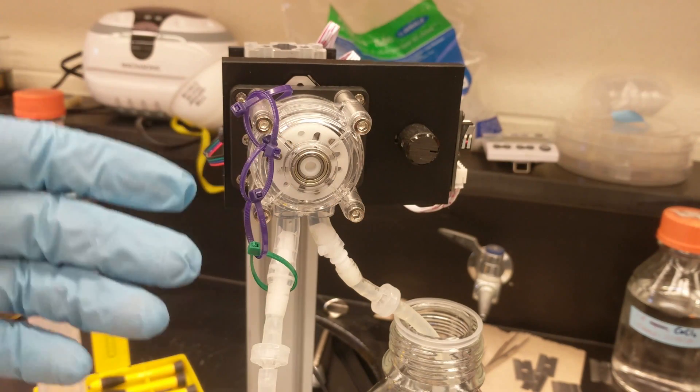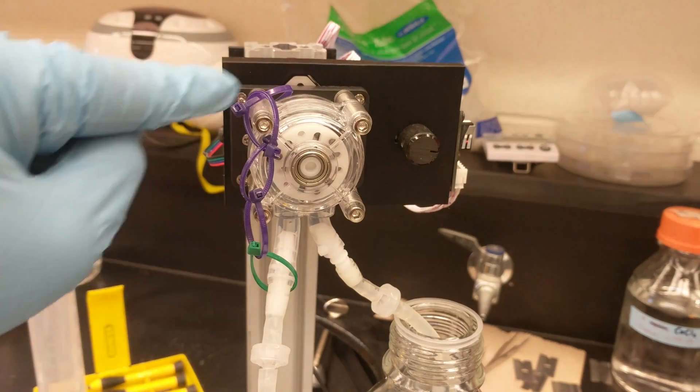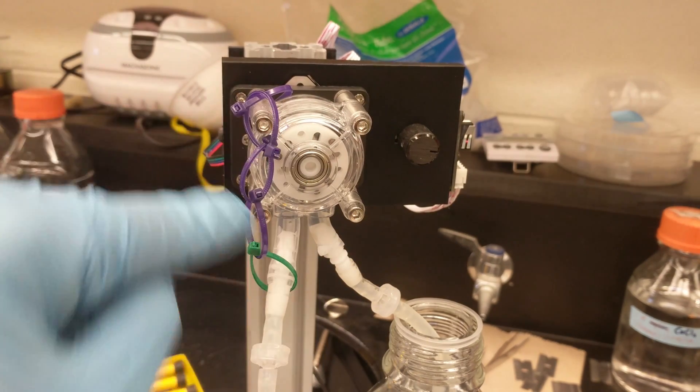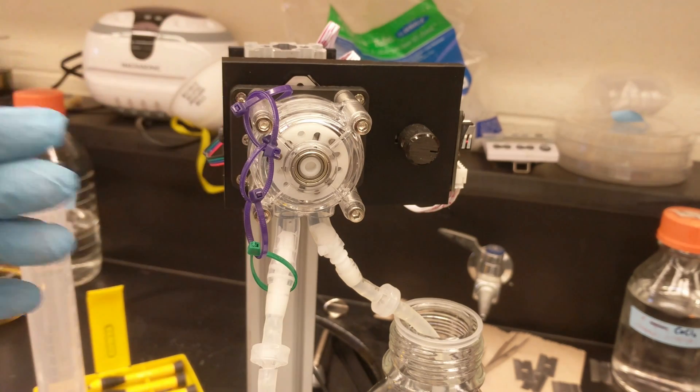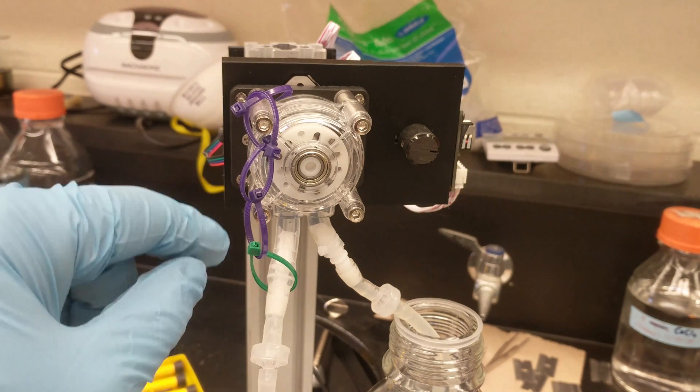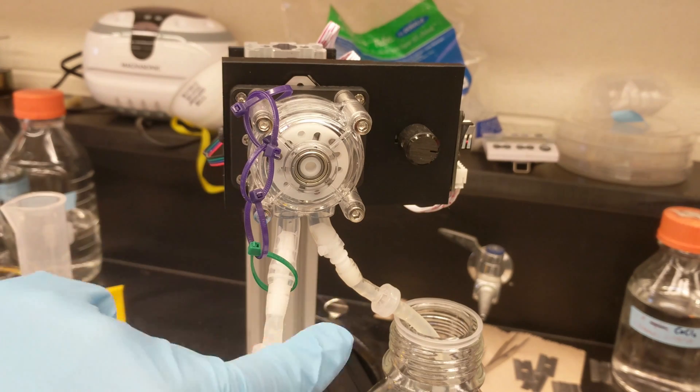And of course the higher that you go, so for example if you were dispensing 50 ml every time, the error across the whole system would be averaged out over a larger volume and your error will drop even more, because the stepper motor is actually pretty precise.